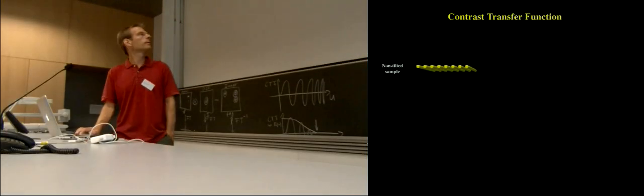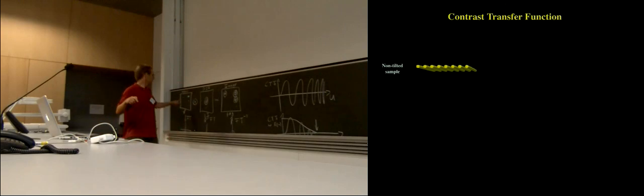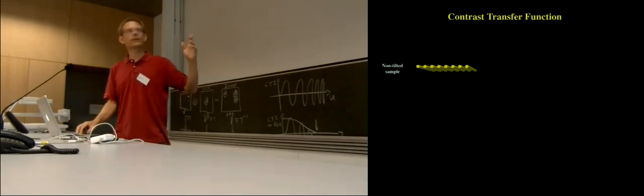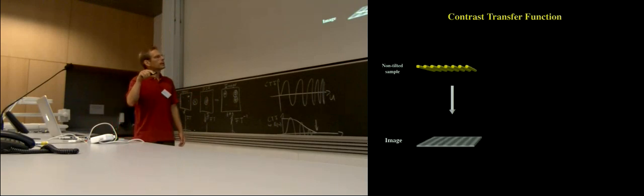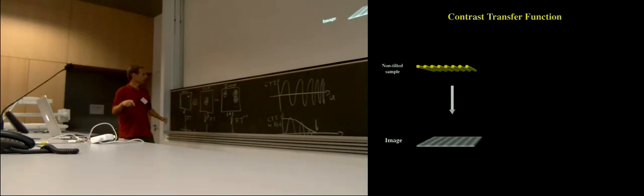So now, back to square one. We have our atoms in the electron microscope. In this case, it's just lines, so some viruses, rods or so. And then we switch on the electron beam and we make an image. And the image here shows an image of our structure, and that's convoluted with a point spread function.